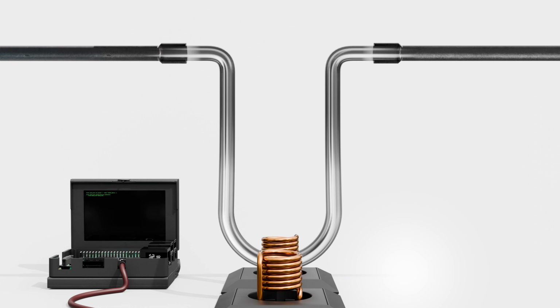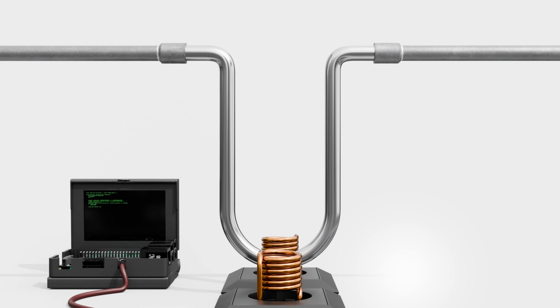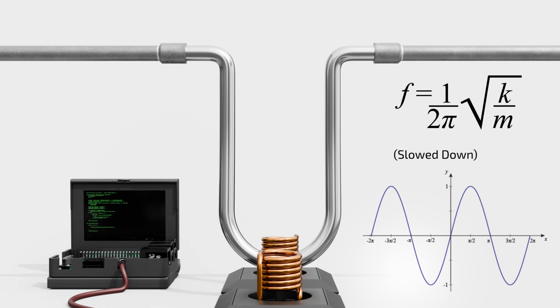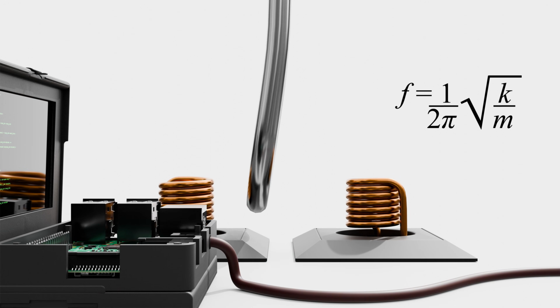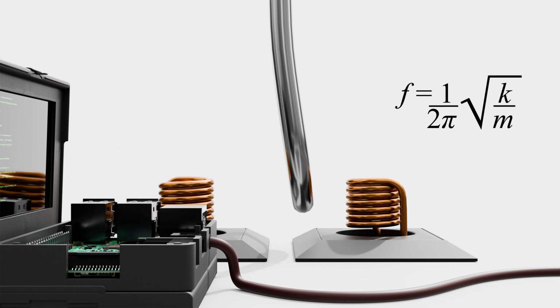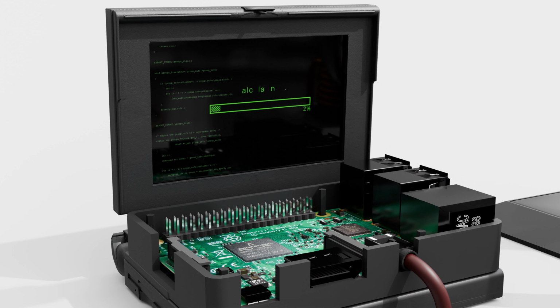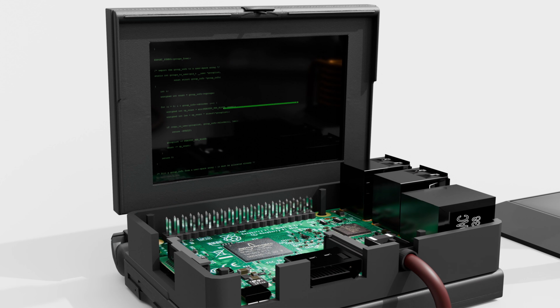They work by drawing the fluid into a U-tube and then vibrating it using electromagnetic coils. If you remember from physics, the mass of the U-tube and the spring stiffness of the walls make it a harmonic oscillator that resonates at a frequency that is dependent on the mass inside the tube. Because the volume of the tube is fixed and can be calibrated, by measuring the frequency and running the calculation, we can measure the density of the fluid in the tube. All of this is performed in the circuitry of the density meter and it reads out in seconds.